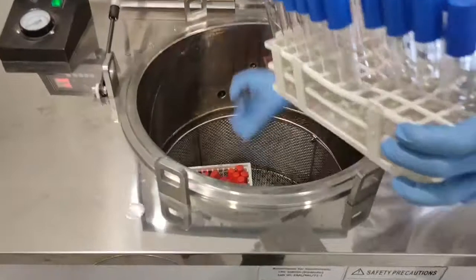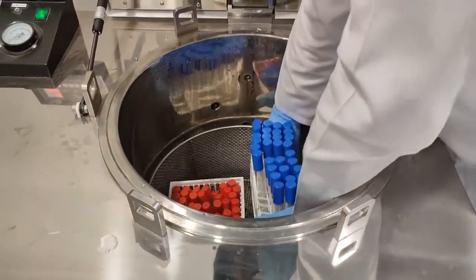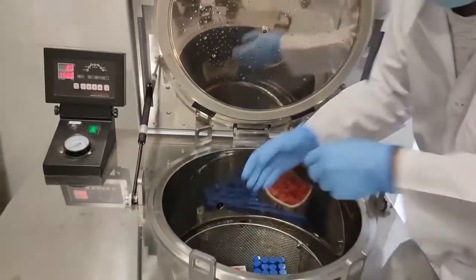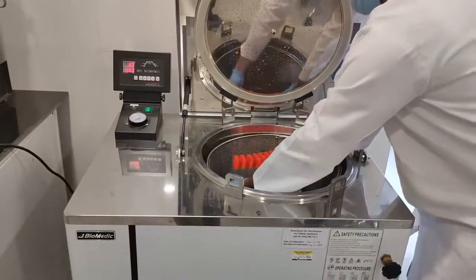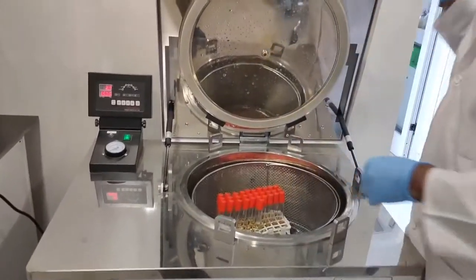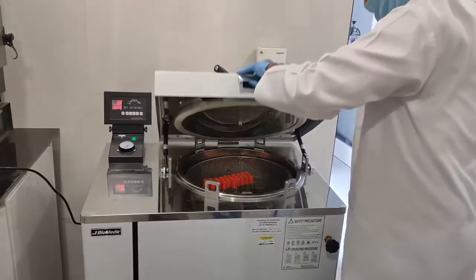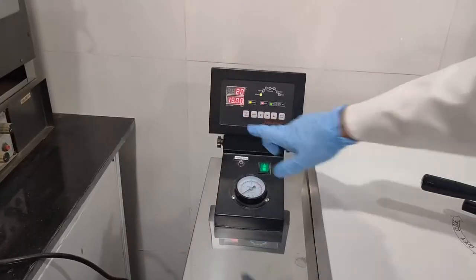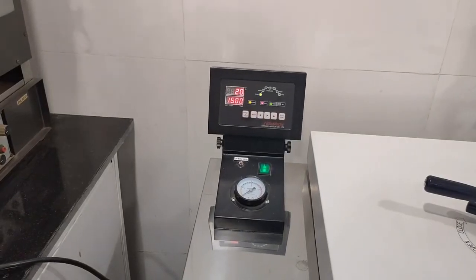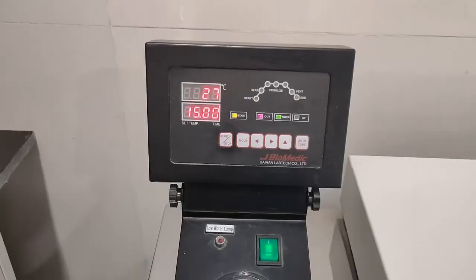Place all tubes containing normal saline and tubes containing A1 media along with tips inside the autoclave. Sterilize them by autoclaving at 121°C, which corresponds to 15 psi, for 15 minutes.